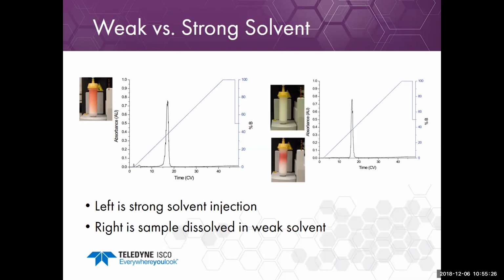Okay, I've got one last question. How in general do you use reverse phase compounds to dissolve the compound? That takes a couple of steps, and if you send us your email over here, I'll be happy to send you the application notes that apply to that.